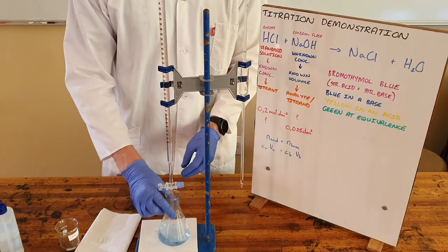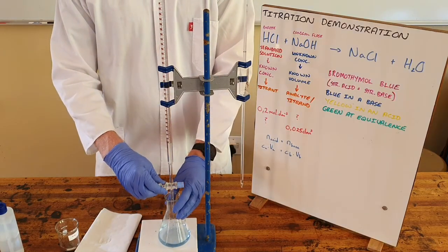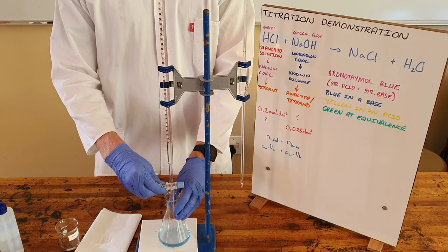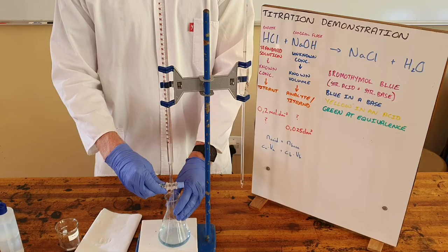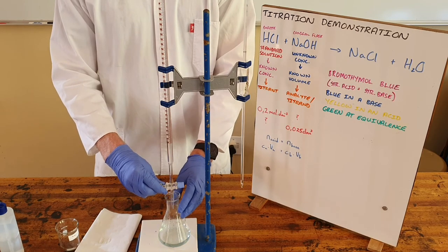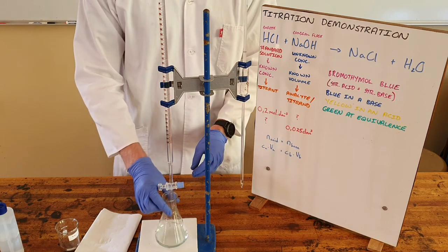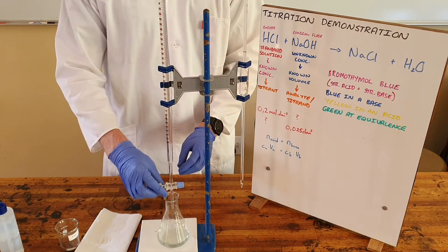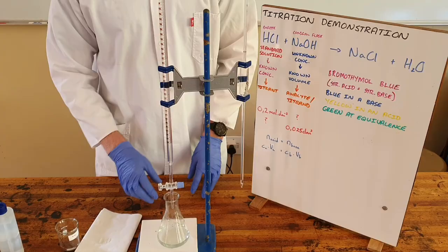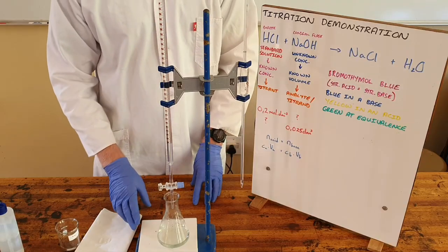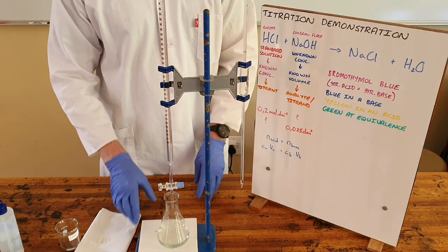Once again taking care to mix this properly because you do not want to pass the equivalence point because then you do not know what exact quantity of acid is necessary to neutralize completely with the base and what you can see here is it is literally one drop that takes the solution from being blue to being green. So we say that this is the equivalence point we can read here that I've added 12.7 milliliters of acid.